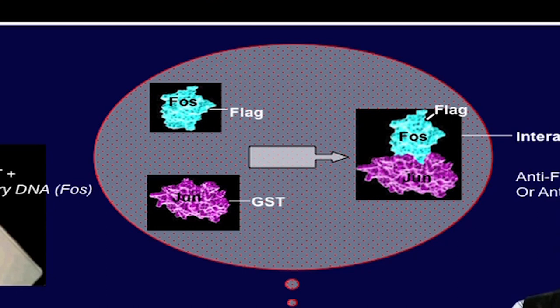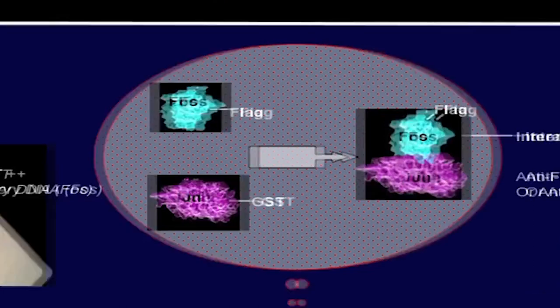As you can see in the slide, the whole cell lysate is mixed on the chip surface, and after incubation, when proteins are expressed at the same time, query cDNA will also express the proteins. Then if it finds the binding partner, it is going to bind to those features, which can be detected by using protein-specific or tag-specific antibody. By performing this type of experiment, the authors allowed co-expression. It means both query and target proteins were expressed in the same environment, which allowed very natural protein interactions to happen. There is a good likelihood that they are going to identify the right interactors.